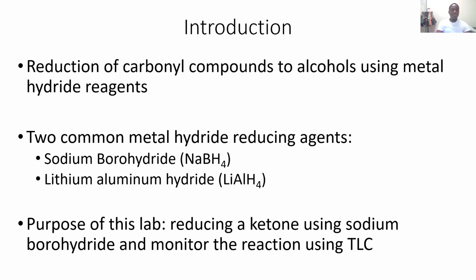The purpose of this lab is that you're going to be reducing a ketone using sodium borohydride, and you'll be monitoring the reaction using TLC. You've been introduced to TLC. TLC is basically the paper chromatography you did in your chromatography lab. But you won't be doing this yourself; you'll be watching someone do it. You'll be using the TLC to monitor the progress of your reaction. I'm going to shed more light on that as we carry on in this lecture.